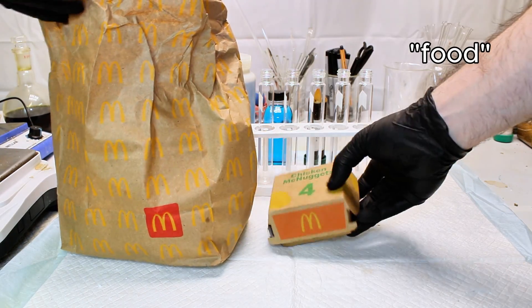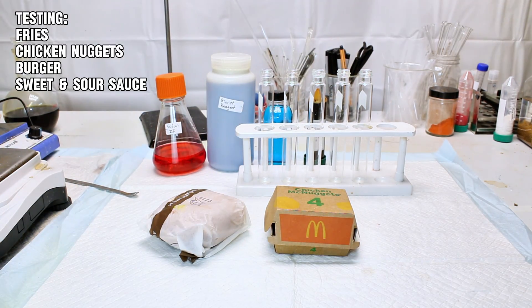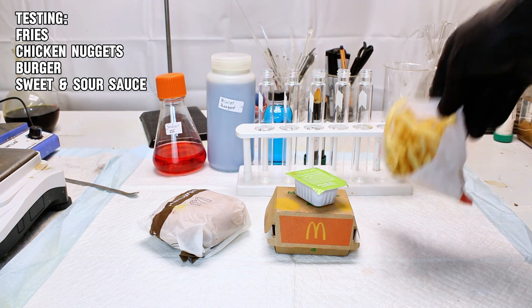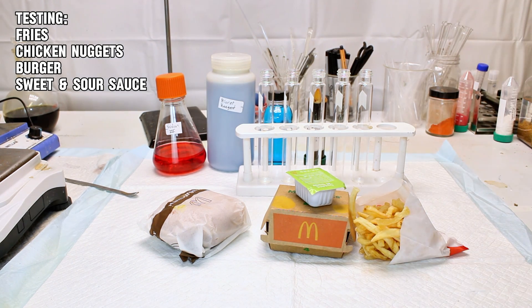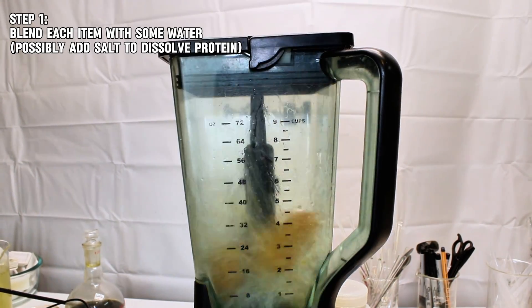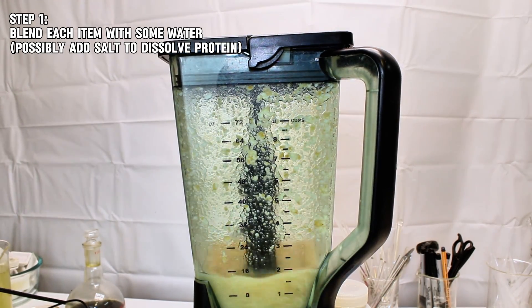And the food I decided to test consists of a few items I picked up at McDonald's. Here I've got some fries, some chicken nuggets, a basic hamburger, and some sweet and sour sauce I got with the nuggets. The first thing I want to do is blend each of these items separately in some water to try and get a somewhat homogenous slurry.